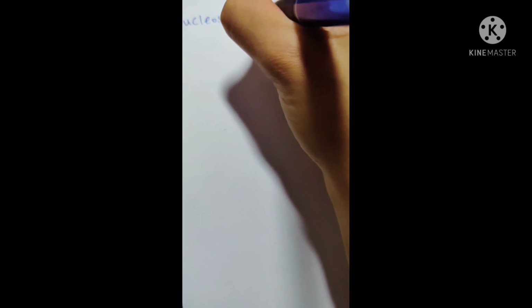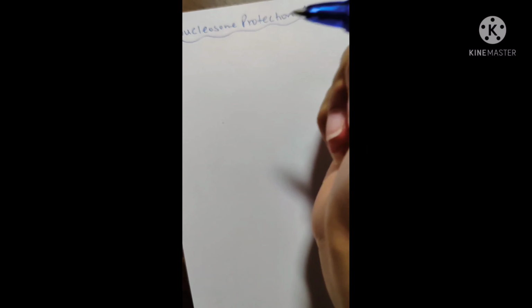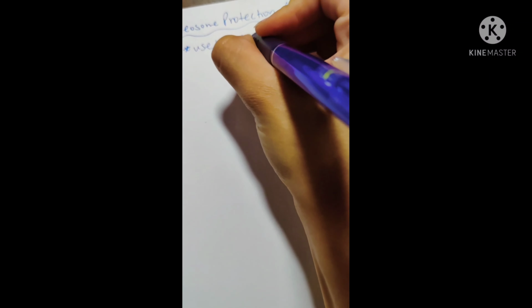Okay, so first we'll begin with the nucleosome protection assay. Pretty much what this is, it's a laboratory method that's used in biochemistry as well as in genetics.